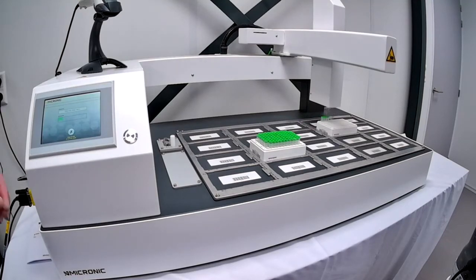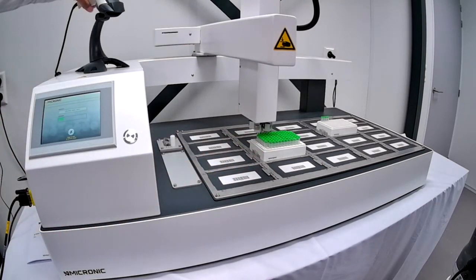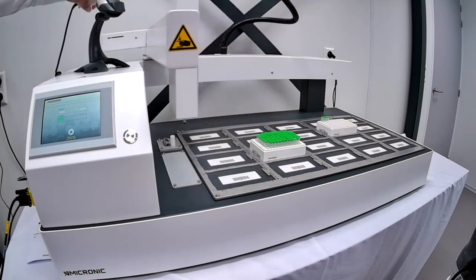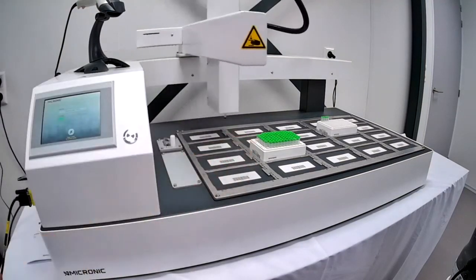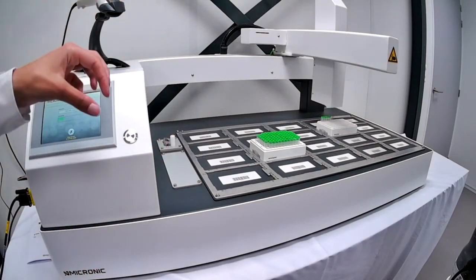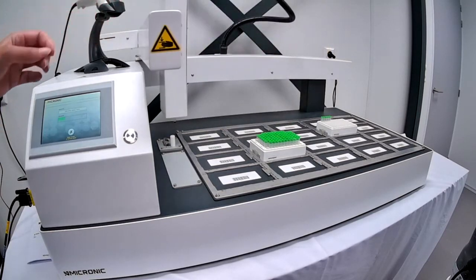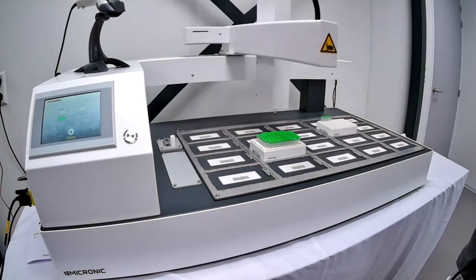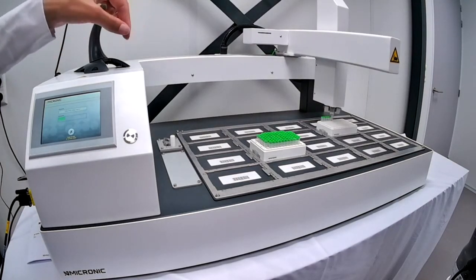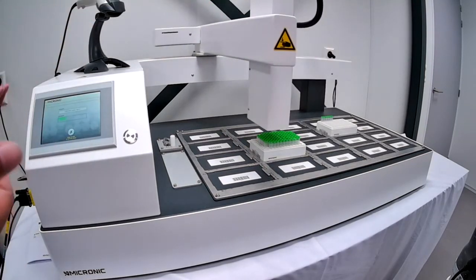And how do you do that? On every position there's a barcode. You scan the barcode with the barcode scanner, and afterwards you scan the rack barcodes, and then it knows where every rack is, and it will pick the tube from the rack. It places it in the position that you targeted, and you can add the option to have the 2D barcode scanning between that, but you can also do it directly, so picking and placing without the 2D barcode scanner, but that is of course an extra safety option.